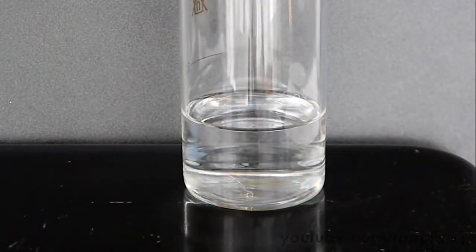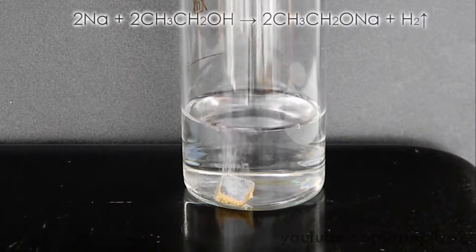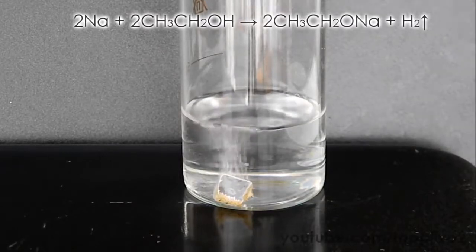Now let's see the reaction of sodium with ethanol. Put a piece of sodium in ethanol. As you can see, the reaction is quite slow.